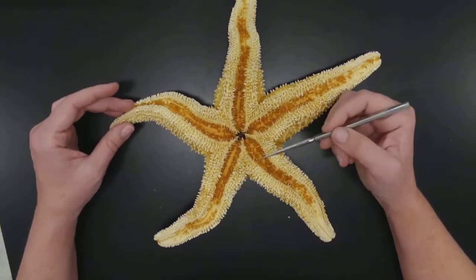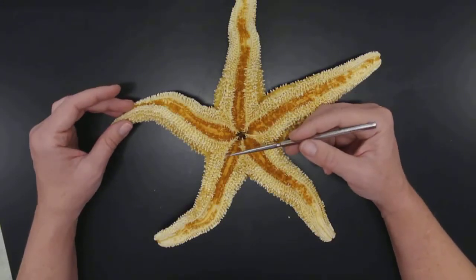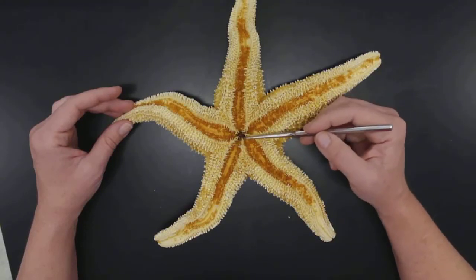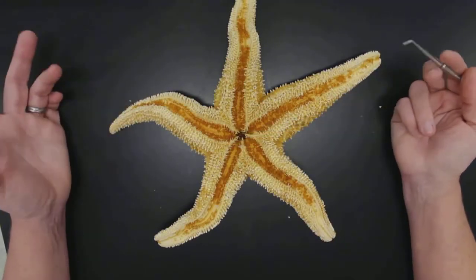At least we can see them in lab. We can see that there are some spines associated here, and that the mouth is that opening — that's it.